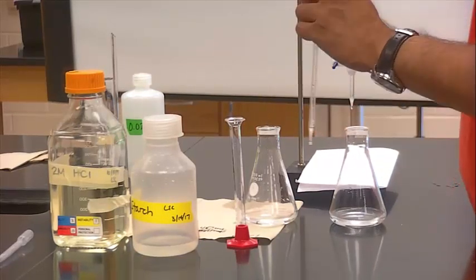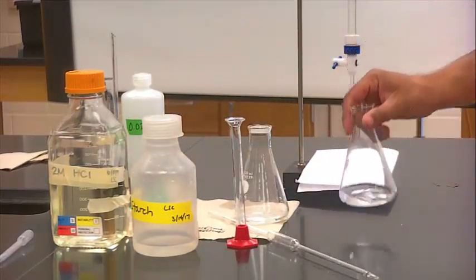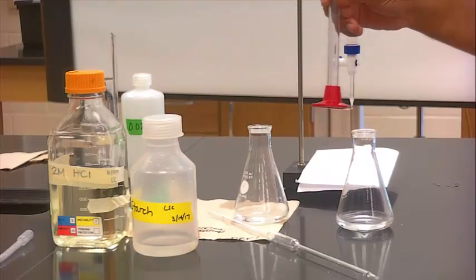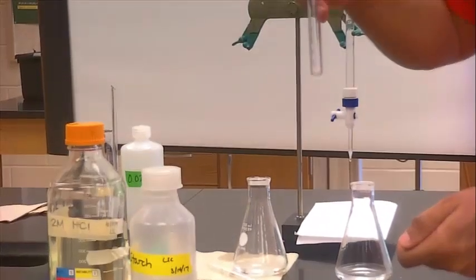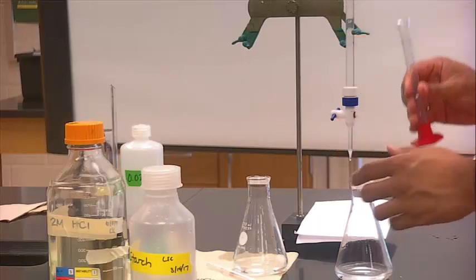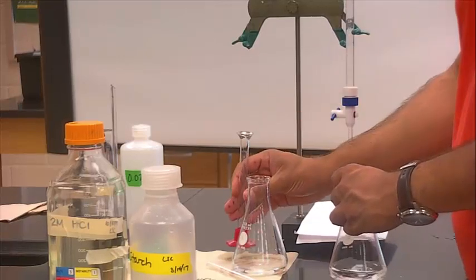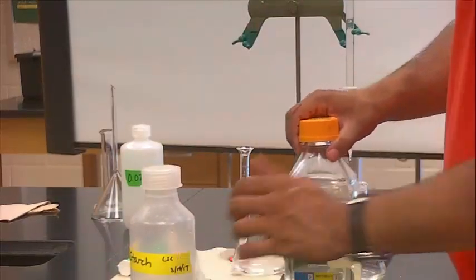So you're going to pipette 10 mils of this. I've already done that. So 10 mils of your filtrate, about 20 mils of water, and then you're going to add your potassium iodide pellets, about 1 mil or so. So you can just be approximate here. About 1 mil. So that's going to go in here. We'll add 20 drops of the HCl.